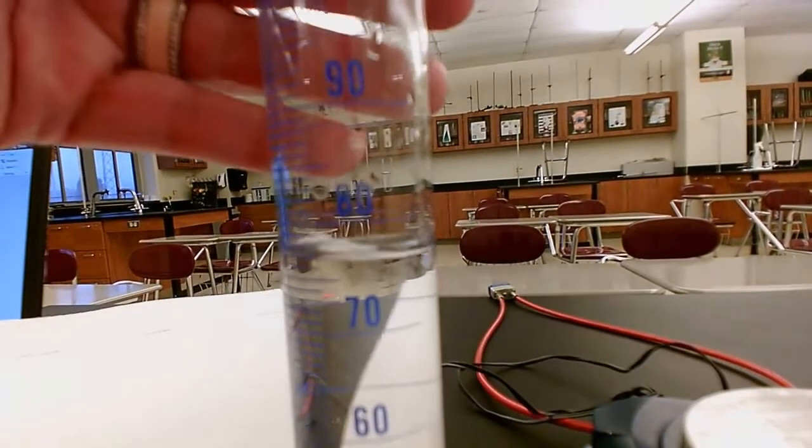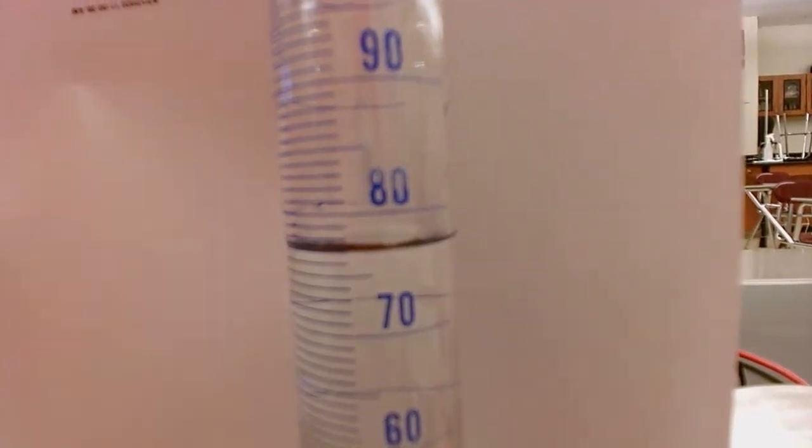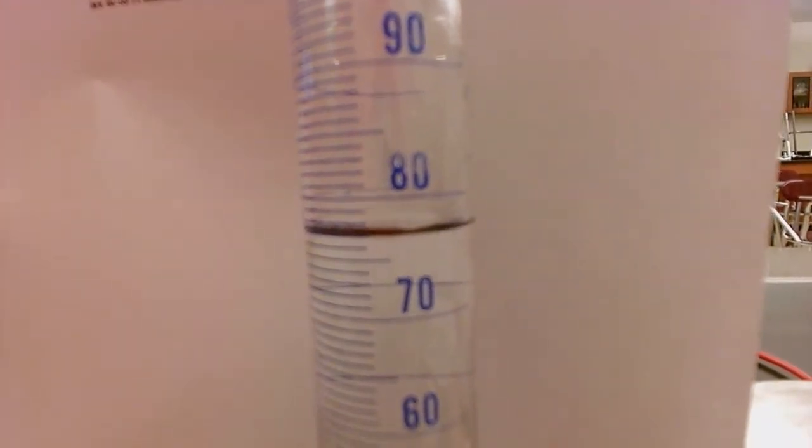If you need me, I can move it just a little bit. Awesome. This is the volume of the water and the solid. You read it off the graduated cylinder.